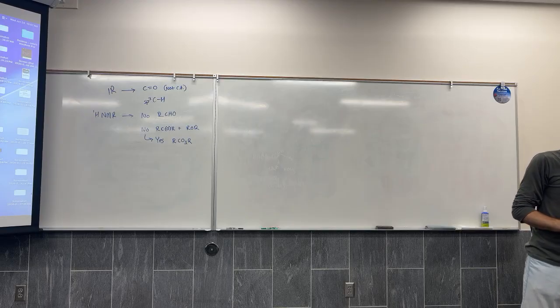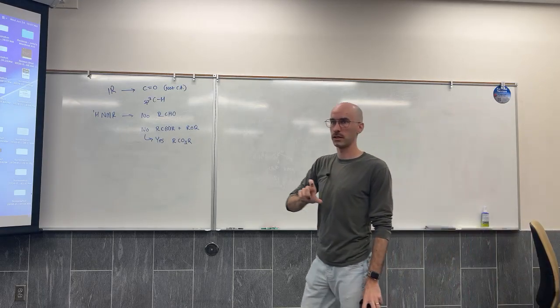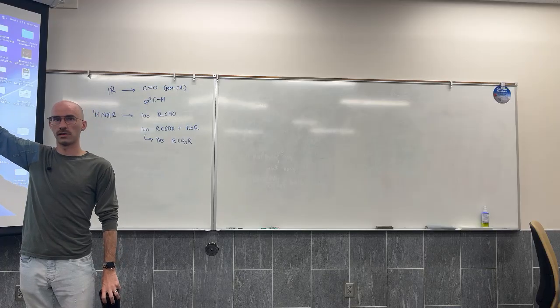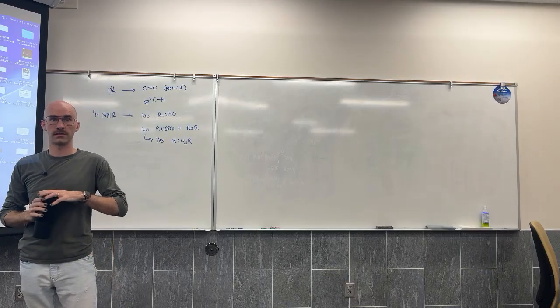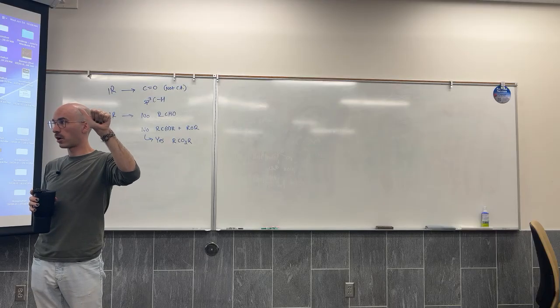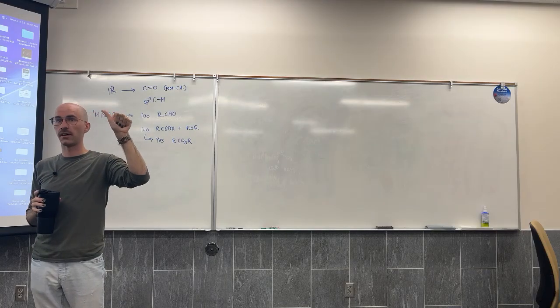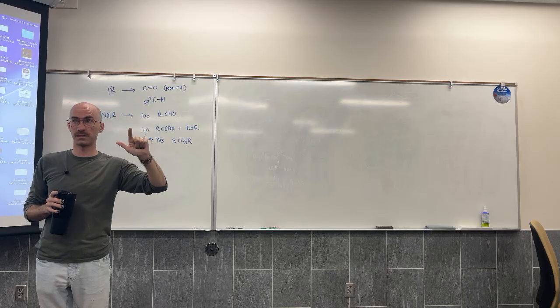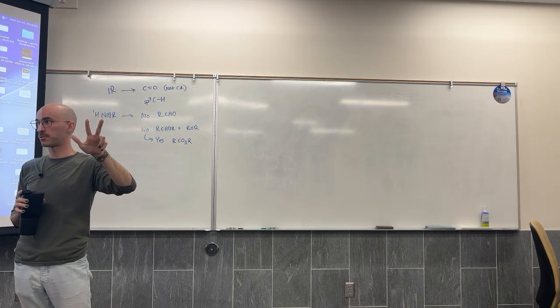How did I leverage the NMR in combination with what I already learned from the IR to feel confident that there is an ester? Ester does not show up somewhere specific on the chemical shift. Ketone does not show up somewhere specific. Ether does not show up somewhere specific.